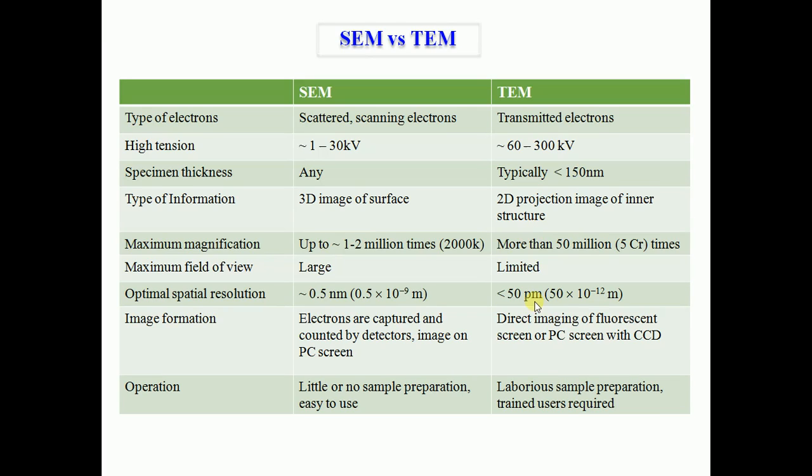For SEM, very easy, meager sample preparation can be done. But in case of TEM, you need laborious sample preparation, and trained users are required.